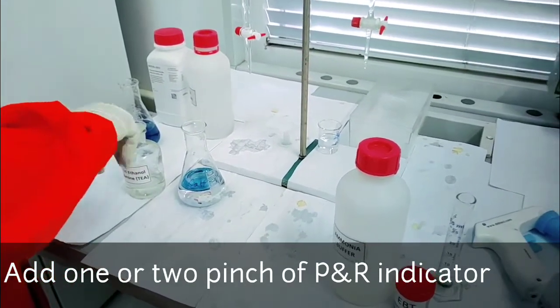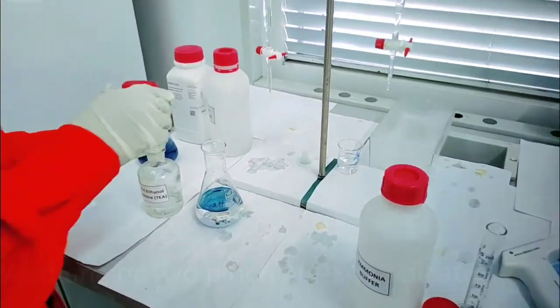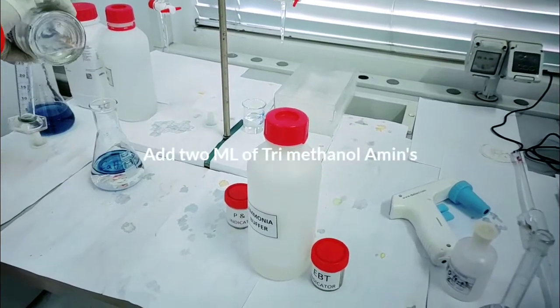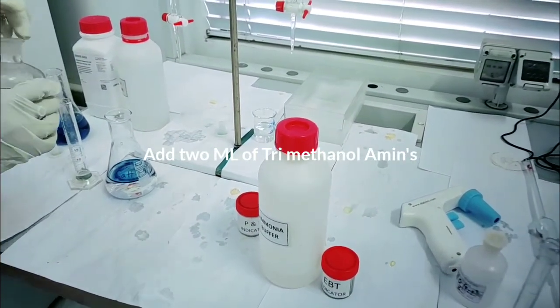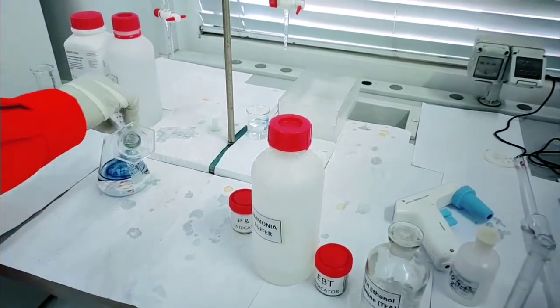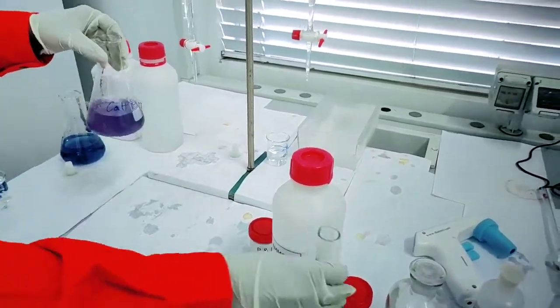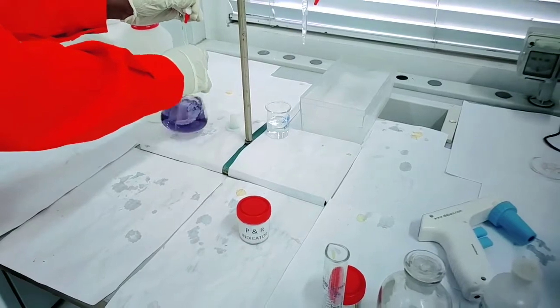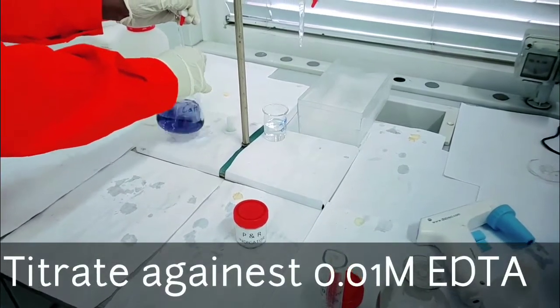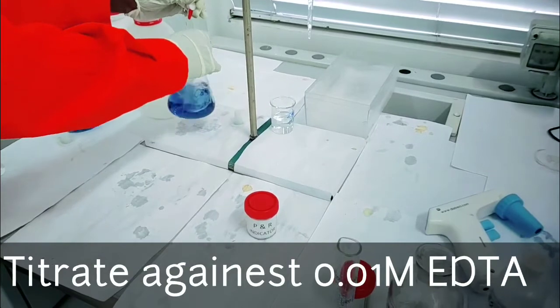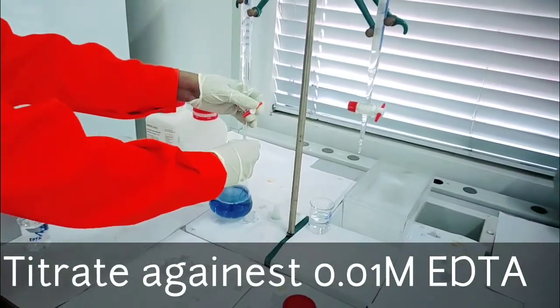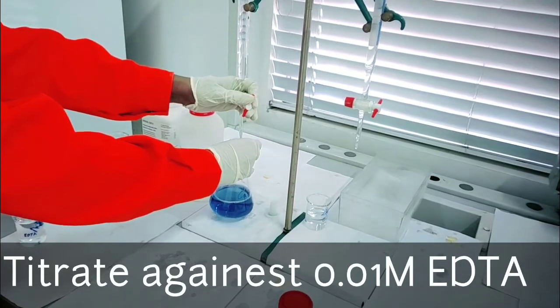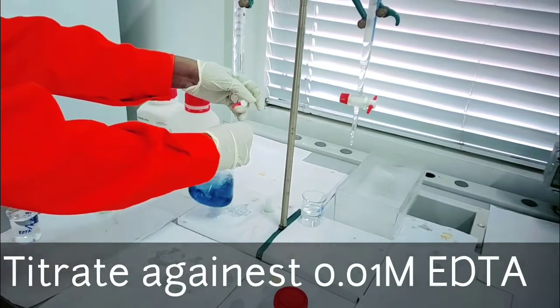Add P&R indicator, Patton and Reeder indicator. Add 2 ml of TEA, triethanolamine. Titrate against 0.01M EDTA, ethylenediamine tetraacetic acid.